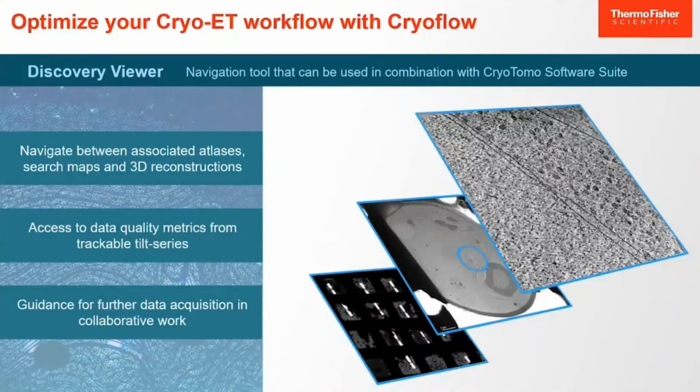So for a selection of the best tomogram quality, for example, you can go through this discovery viewer and interactively select and play with all the experiments that you have done, including having insights into the quality metrics data, like astigmatism, defocus values, etc.